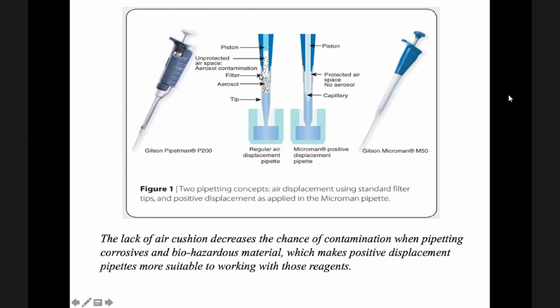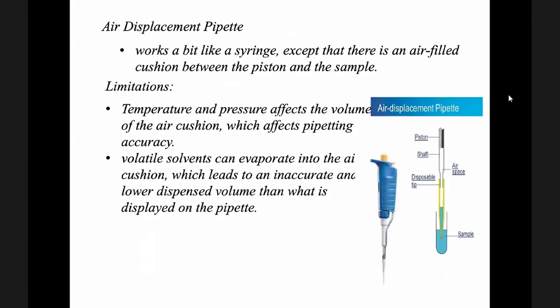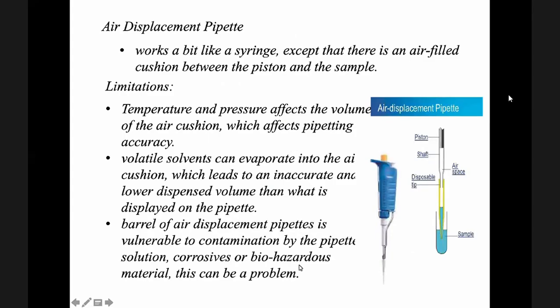But despite having a filter, it is still prone to contamination, to aerosol contamination, especially with biohazardous material and corrosives.